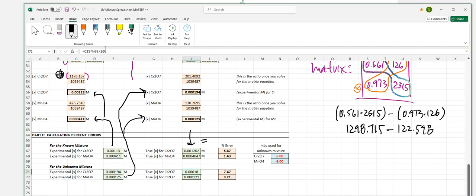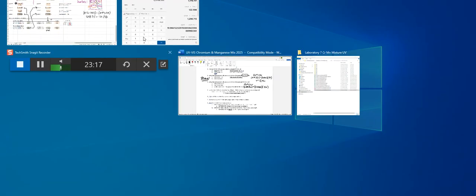So these numbers, well, they're going to be based on the volumes that we used. We have taken your concentration. We know how we've diluted it, but you don't. So on my spreadsheet, I'll do something very similar here, but for these, you're actually going to leave blank. I will fill those in for you because I know what I've used. You don't. You're going to have to keep your fingers crossed, and hopefully your error is not going to be a lot. And then the error here, you're actually going to leave those blank as well.